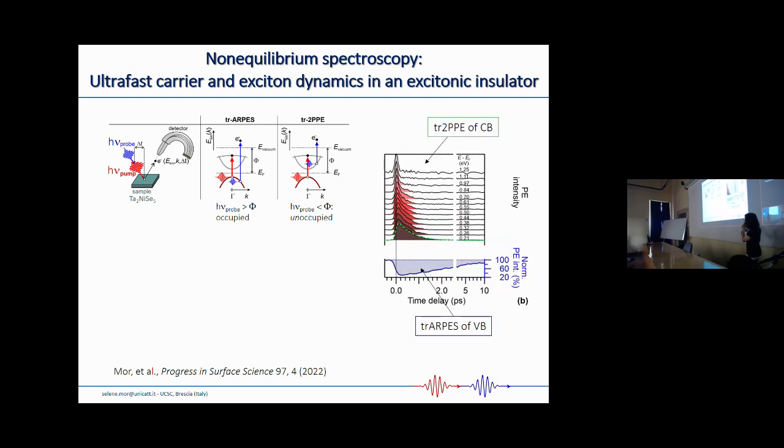There, you have some certain absolute intensity, and if you follow the evolution in time, at the same time delay where the conduction band is emptied, you still have a massive vacancy of the valence band. And I wouldn't relate it to the matrix element, if you assume that the matrix element is not time dependent, of course.